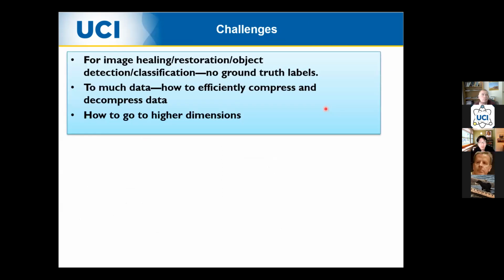So the challenge here is that for the TEM, unlike ImageNet, which has already been created, interestingly, by computer scientists, to actually train this network for the TEM, we don't have a TEM ImageNet. All right, so that means you don't really have a library of images for you to actually do classification, object detection, healing, restoration, all that you want to do for autonomous driving, right?